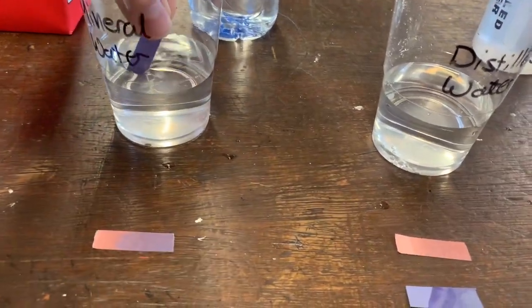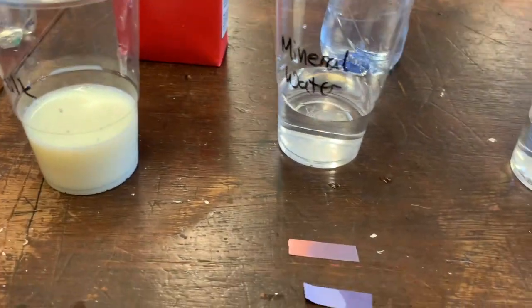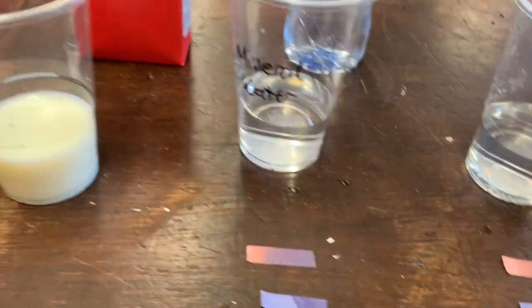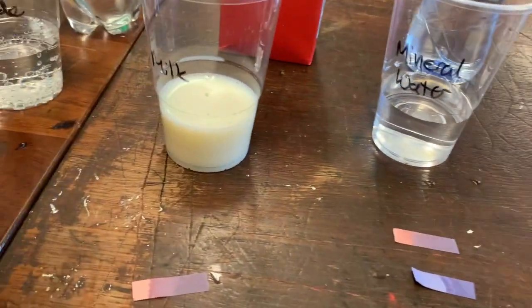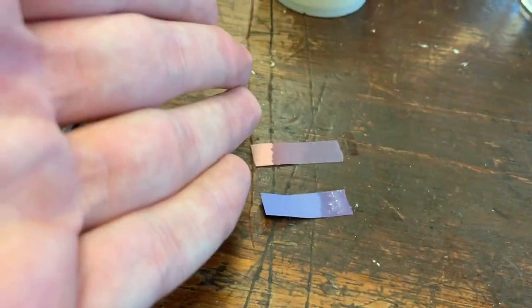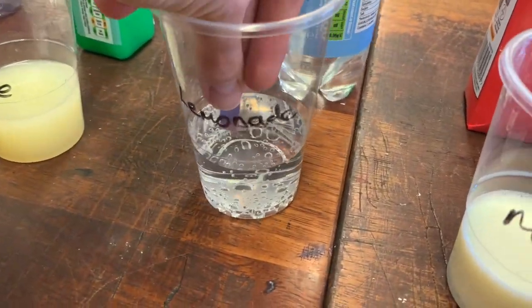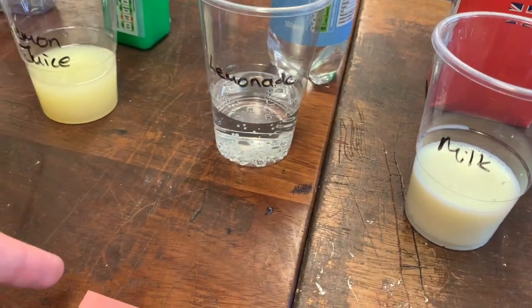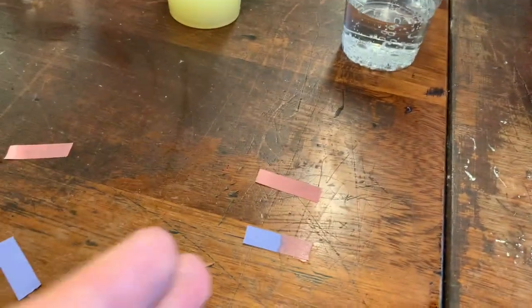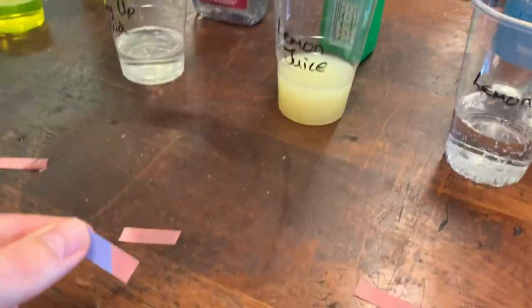This mineral water — no change. So this is blue and blue. Milk — no change. So again, we've got blue and blue. Lemonade — this one's changed red, so we've got red and red. Lemon juice — has changed red, so we've got red and red.